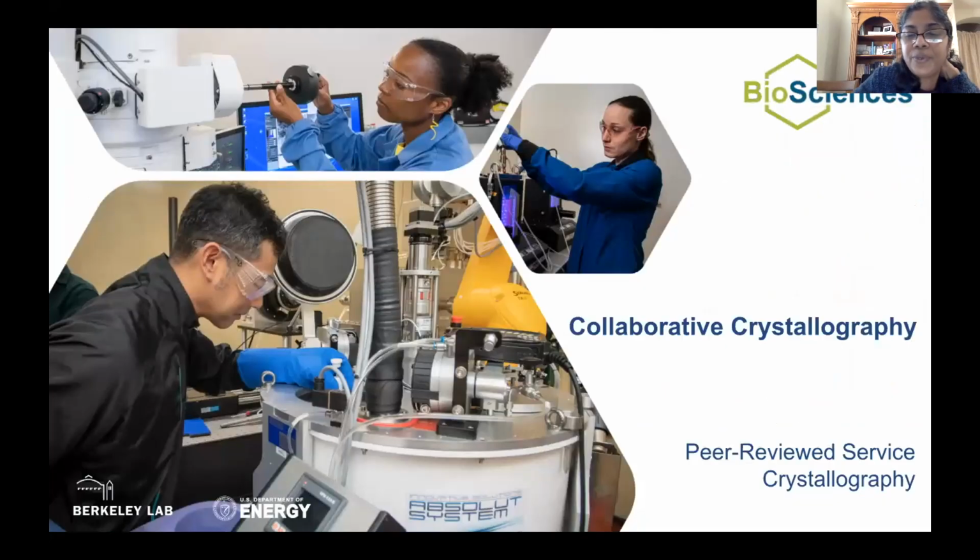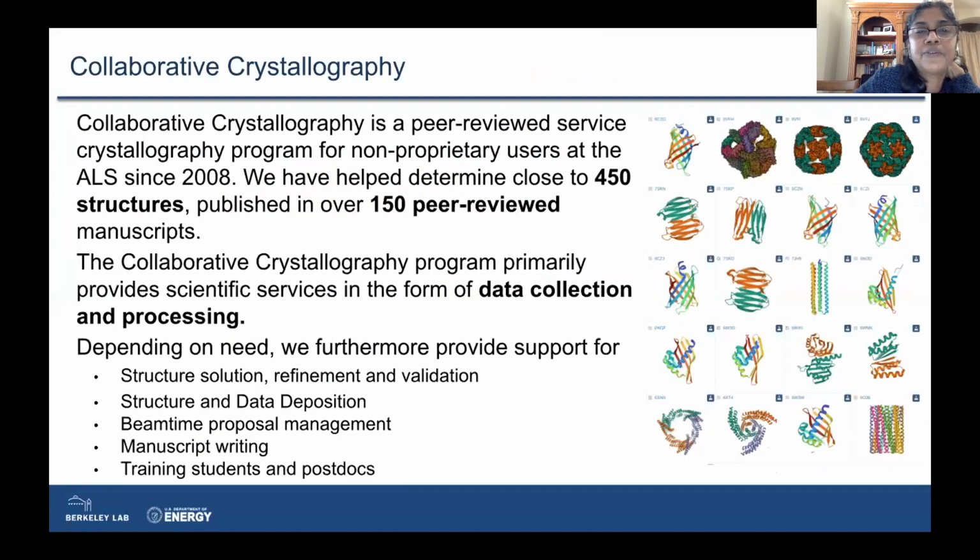Next, I would like to introduce Banu Sakaran, who's going to tell us about the collaborative crystallography projects. Okay. Hi, good afternoon, everyone. I'm Banu Sakaran. I will be giving a brief presentation on the CC program. So collaborative crystallography is a peer-reviewed service crystallography program, and it's only for non-proprietary users, and it started in 2008 at ALS. And we helped users determine close to 450 structures published in over 150 peer-reviewed manuscripts.